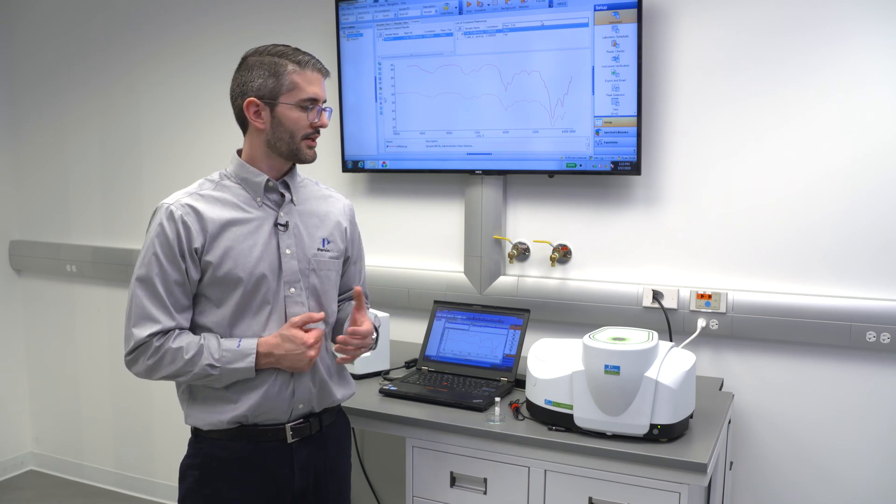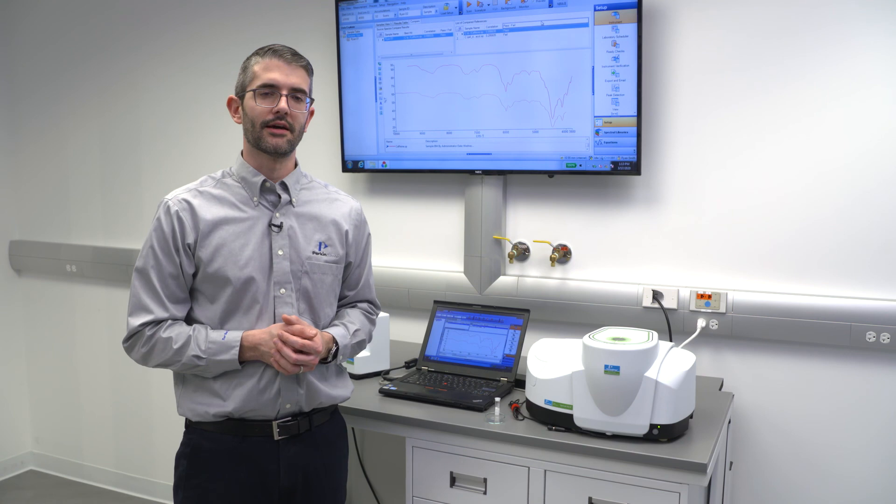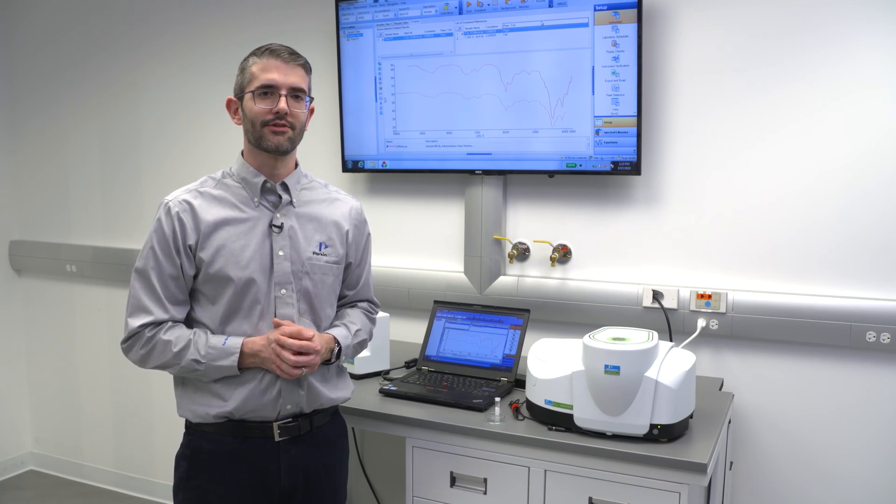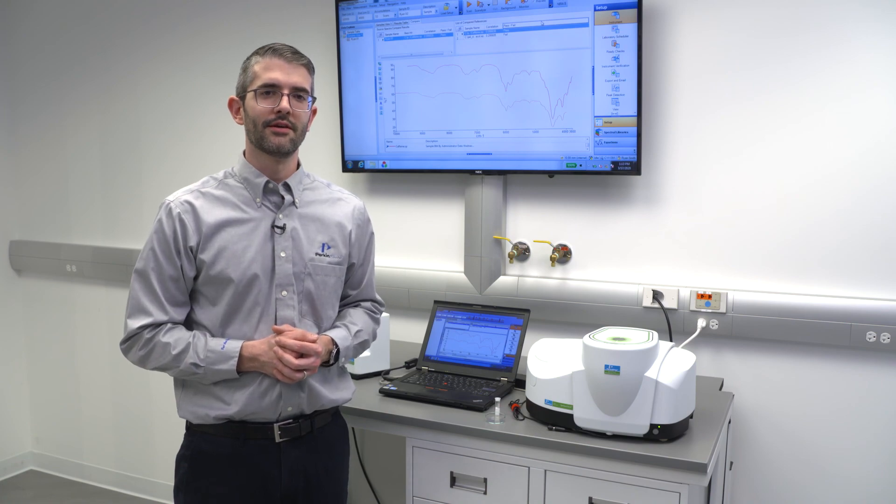I hope you found this video to be informative. If you would like more information about Perkin Elmer's Spectrum 2N FT-NIR instrumentation, or any of our other product offerings, please feel free to contact your local sales representative. Thank you for your attention.